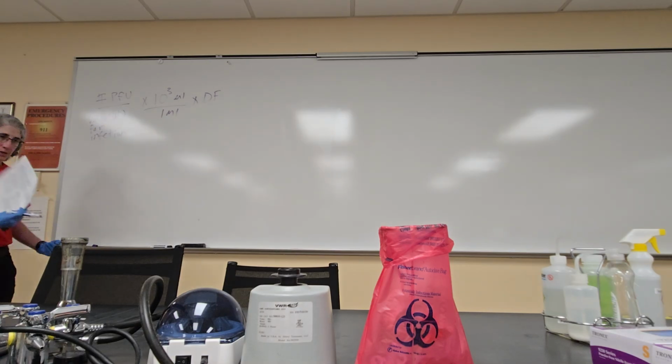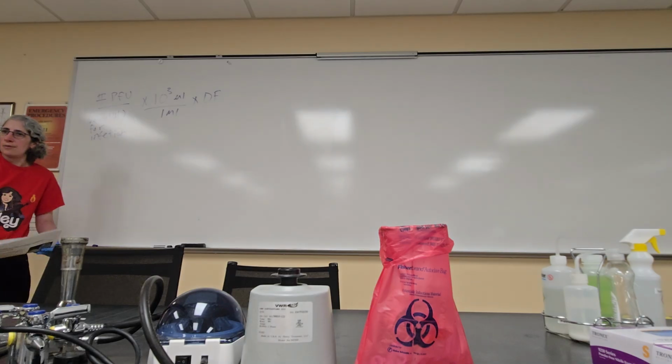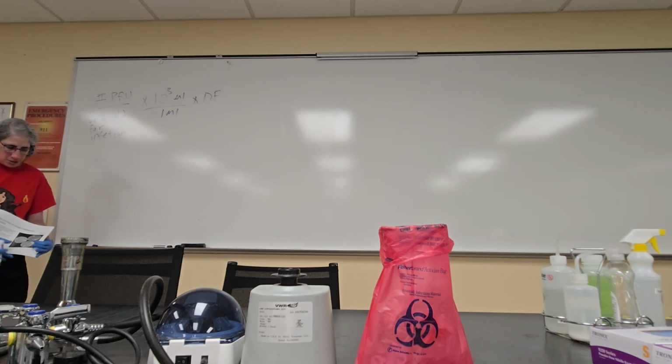So in my example here, I had used a fake number of 150 plaque forming units on a plate, and the plates that I used here as an example, I've got 3 plates, and we've got one that has a dilution of 10 to the minus 1, which represents our webbed plate, and the one that has between 20 to 200 is the 10 to the minus 3 dilution. So it would be the 10 to the minus 3 dilution that you would use.